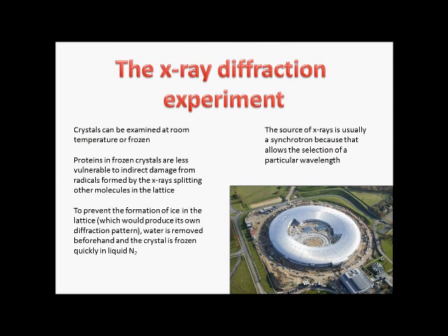When X-rays interact with water molecules in the crystal structure, what they sometimes do is split it into radicals, and these radicals can react strongly with your protein and affect its structure, which is something you don't want. One way to get around this problem is to freeze your sample. This means that the water molecules have less energy, so when they're split into radicals, those radicals have less kinetic energy, so are less likely to react with your protein, just like freezing something will slow down the rate of any chemical reaction.